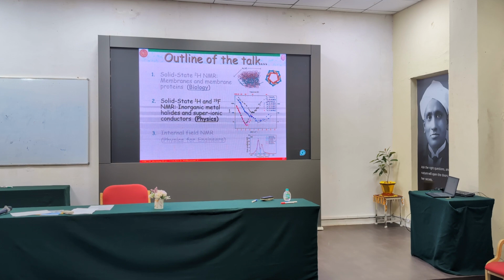For that, what they do is make your sample tilt at a particular magic angle, and then they spin the material, so that during that motion we artificially make it move like a liquid, and then I get a high resolution spectrum very much similar to that. I never do that. I don't artificially make the dipolar interaction among two spin systems vanish. I measure it as it is.